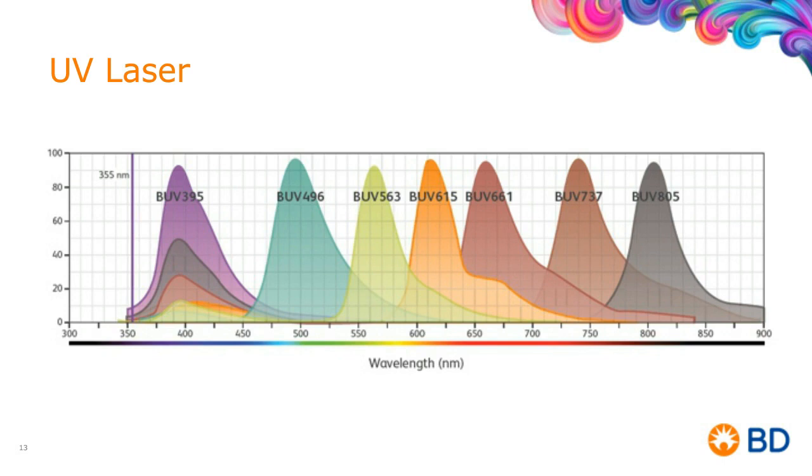So when we look at a specificity like CD45RA and look at that expression profile with virtually any color, let's say a bright color, we'll see that stretch across 4 or 5 logs in conventional flow cytometry. Now, I've had a slide that I've used in a number of decks over time, and it's a wonderful slide that was built because we did a larger panel, and then we backgated in.